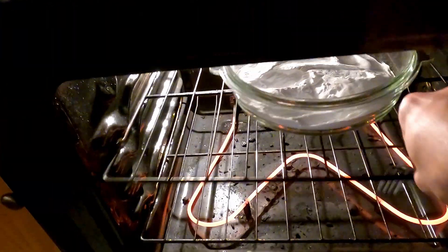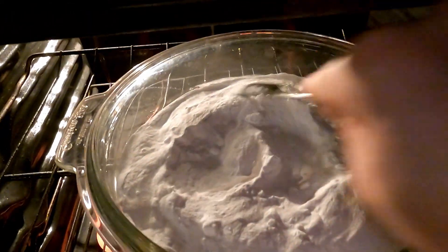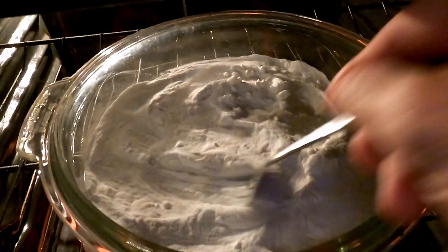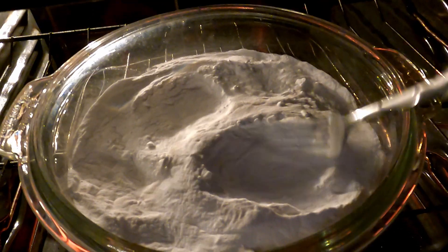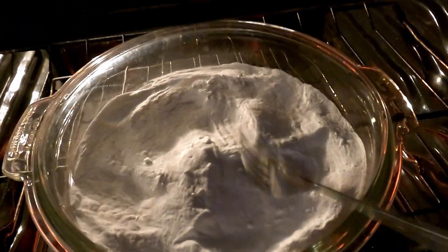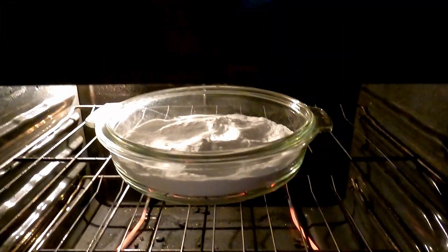The baking soda is now most certainly washing soda — the texture has changed all the way again. Going to bust out a little bit of the clumps as I stir it, just to liberate any remaining water and carbon dioxide. Then I'll turn off the oven and just let this cool down.